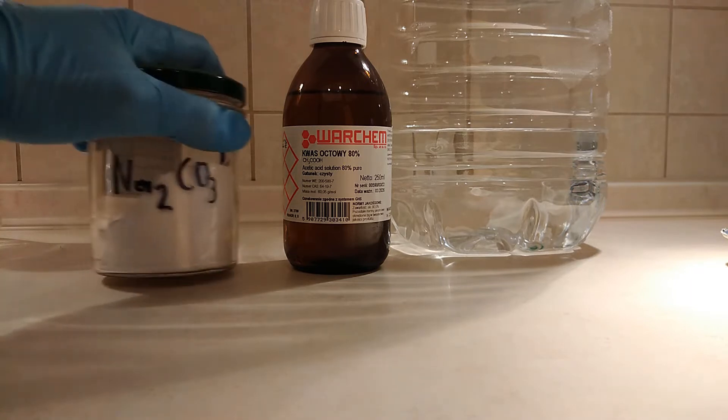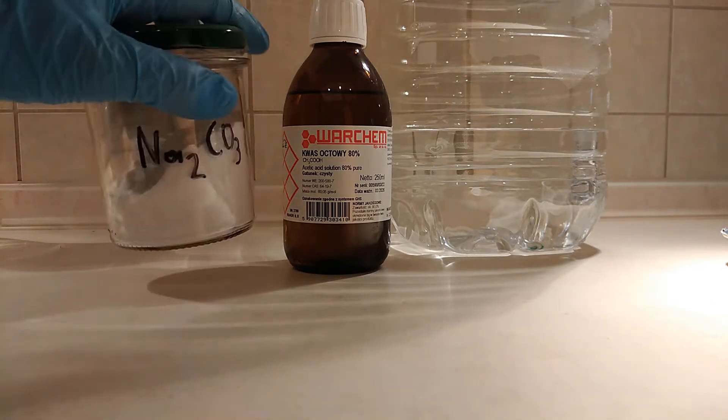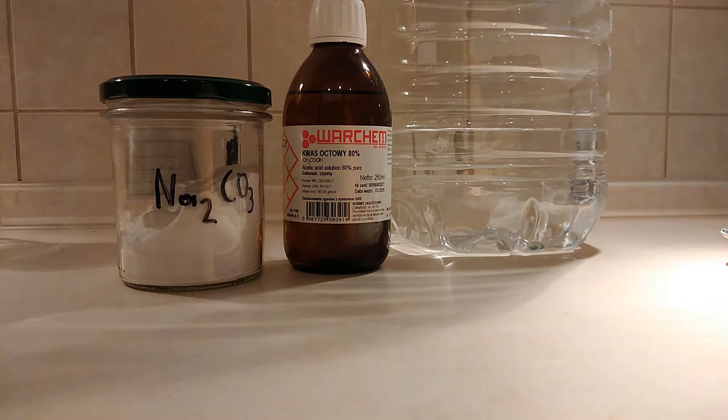And sodium carbonate. You can also use sodium bicarbonate, baking soda, instead. I'm using sodium carbonate because I have more sodium carbonate than sodium bicarbonate. So let's get right into the synthesis.